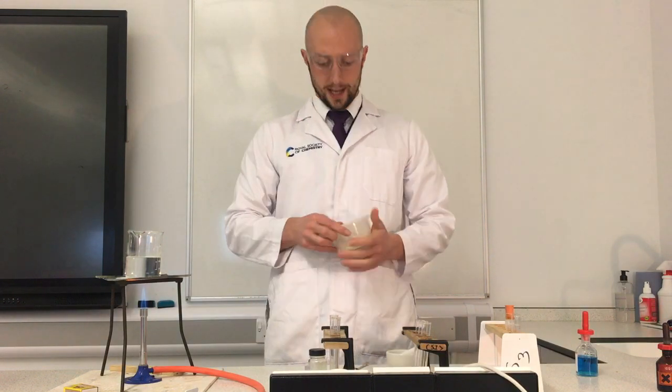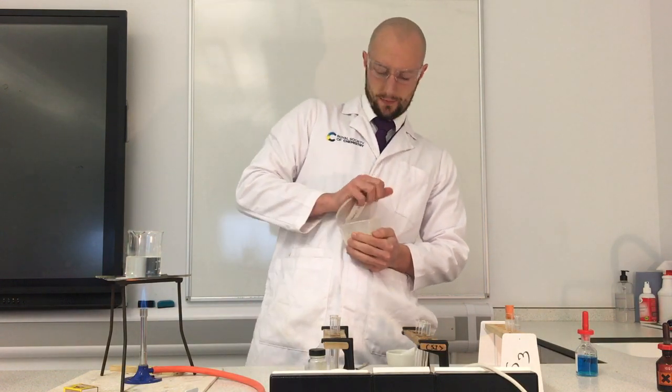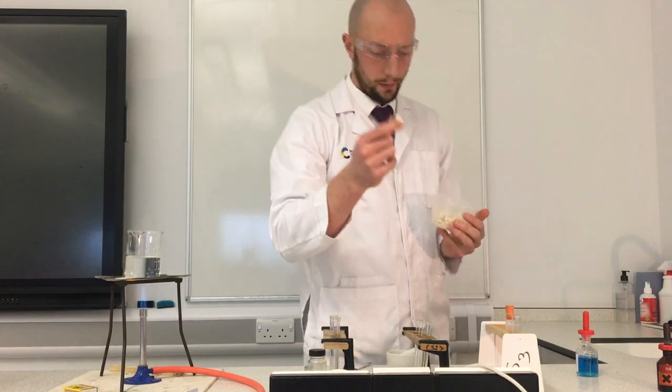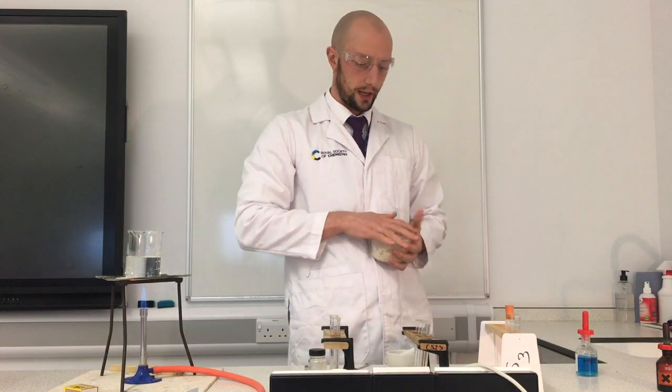The next thing I'm going to test is rice cakes. I'm going to take some of these out. Here you go. There's a piece of rice cake. That's what it looks like. I'm going to see what nutrients are in my rice cake.